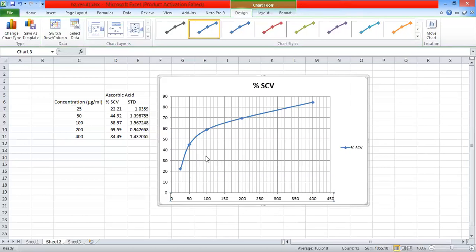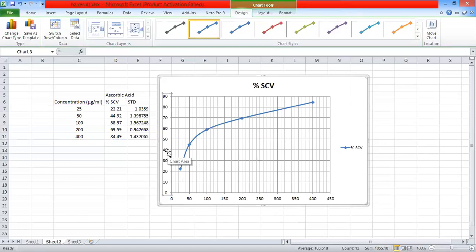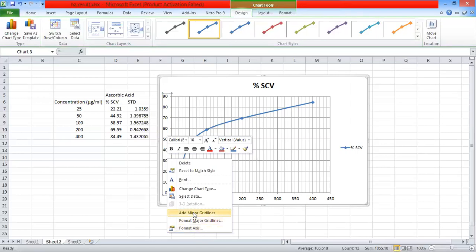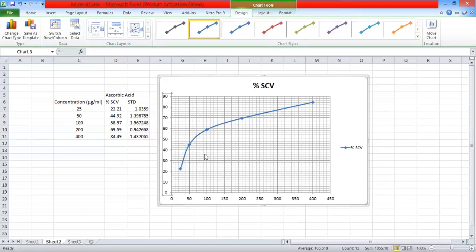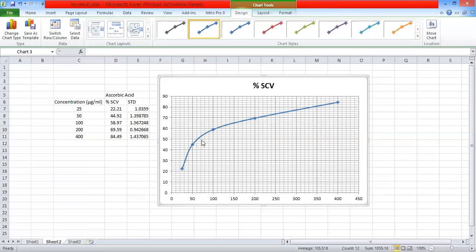This is for the Y axis, and the X axis major grid lines have already been added. Now I am going to add X axis minor grid lines. In a similar way, I select the whole range of percentage of inhibition, right-click, and add minor grid lines. After adding the minor grid lines, you can see that the 50% inhibition occurs between the concentration of 50 and 100. So we are going to exclude other portions and only visualize this portion — between 50 to 100 micrograms per ml.